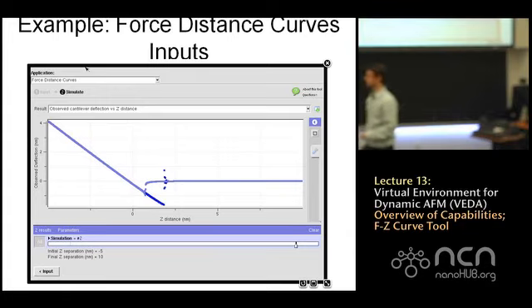And this has to do with the fact that we start in contact, and it takes a certain force for us to be able to remove the tip from the sample. There's inevitably a region where the cantilever can be in either state depending on the initial conditions. So if we're at this range of tip sample gaps between about 0.5 nanometers and maybe 0.75 nanometers, then the cantilever can occupy one of two positions. Either it can be in the attractive van der Waals forces, or it can be snapped onto the sample, simply depending on the initial conditions.